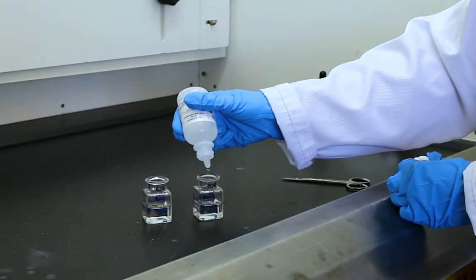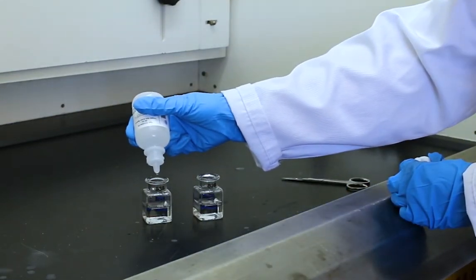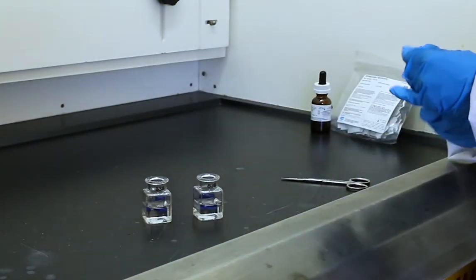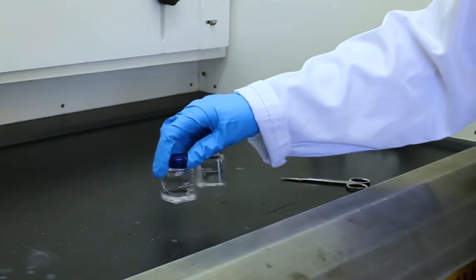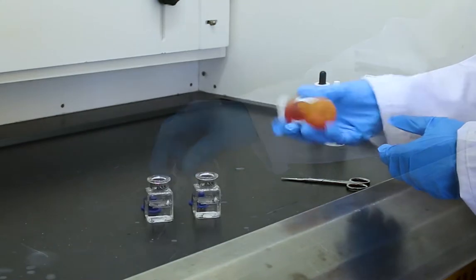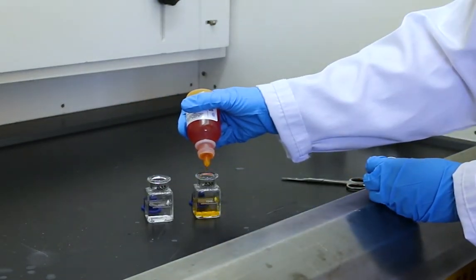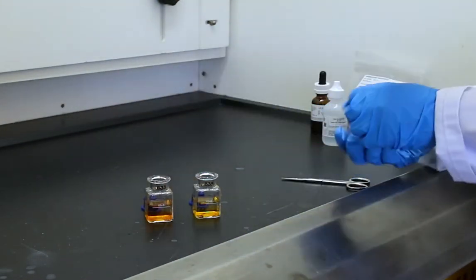Add 12 drops of the alkaline cyanide reagent solution into each cell and swirl them both to mix. Then add 12 drops of PAN indicator solution into each cell and swirl them to mix.